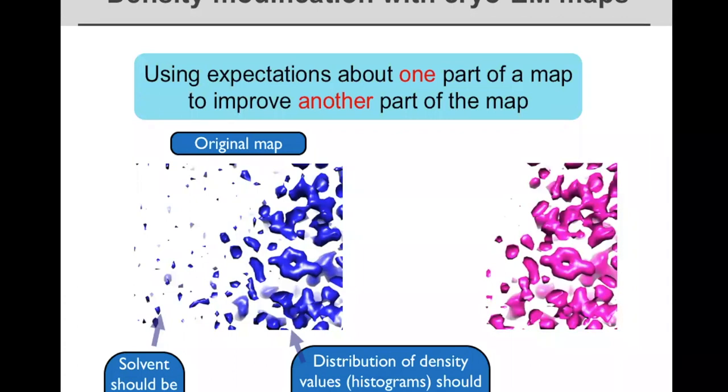In this particular one, they don't match it yet. Once we density modify, we'll obtain histograms that are more similar to the original, to the true ones. Now, this is the original map. This is kind of the best version of the original map that one could produce, at least that I could produce, and then the best density modified map on the right.